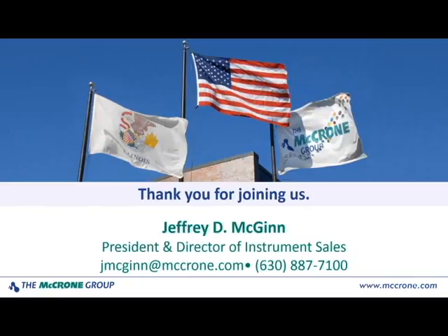One more question here, another one from Andy. What are the recommended conditions like humidity, temperature, vibration, shaking, he mentions? There are really no recommended environmental conditions. We place our instrument on a standard lab bench. We've traveled with these before. We've put them in the back of our car and traveled with them. Not that we use it there, but it needs to be in a standard lab. That's all. You don't need to monitor temperature or anything like that. And if it's on a sturdy table, vibration is never an issue.